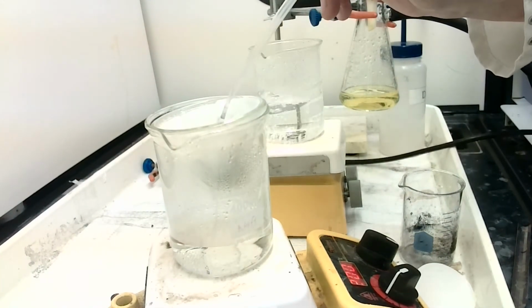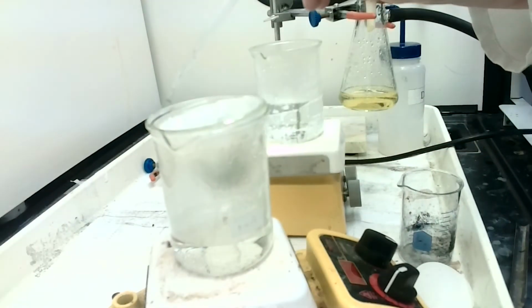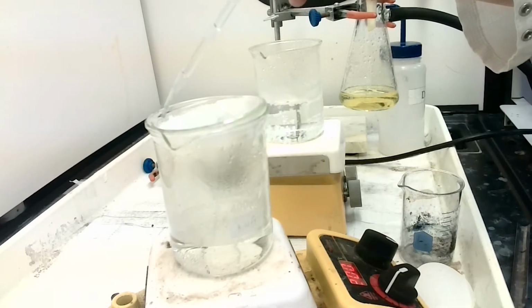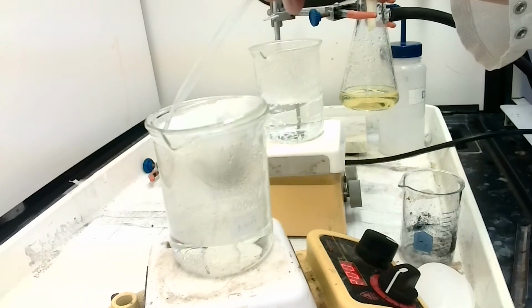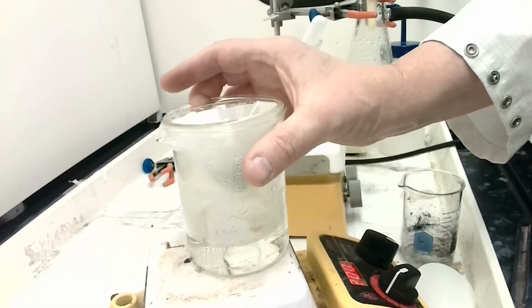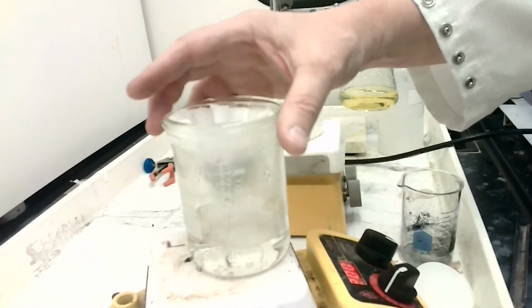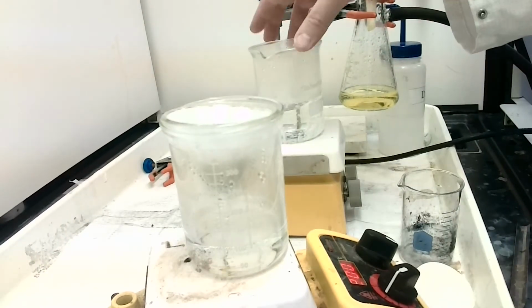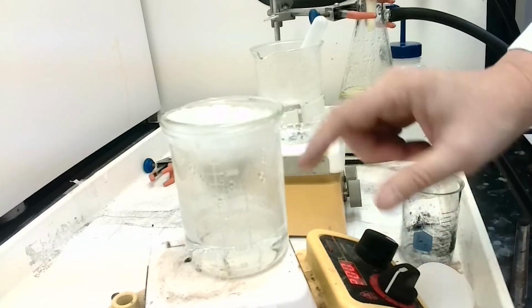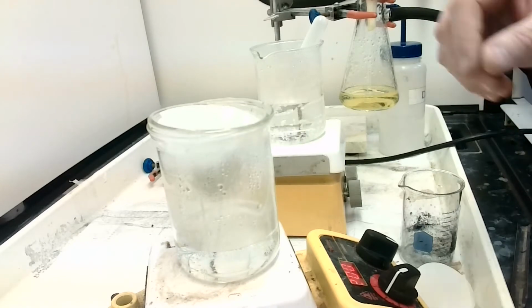Okay, I don't see any more. I see a little bit, maybe right there. Nope, that's just the oil jumping. I'm going to look behind the fold here because sometimes they'll hide in the folds. Okay. All right. I've done what I can. I'm going to put the watch glass on until it finishes stripping all the rest of the way. Then we're going to take this off and we're going to collect our final crystals in this aqueous solution down here that has boiling hot water. We're going to let that cool.